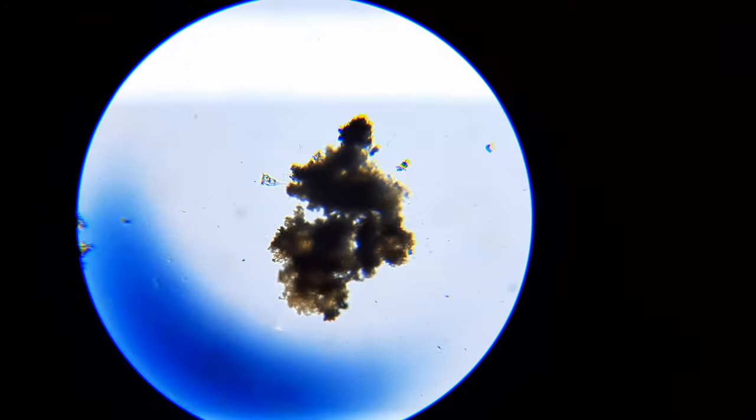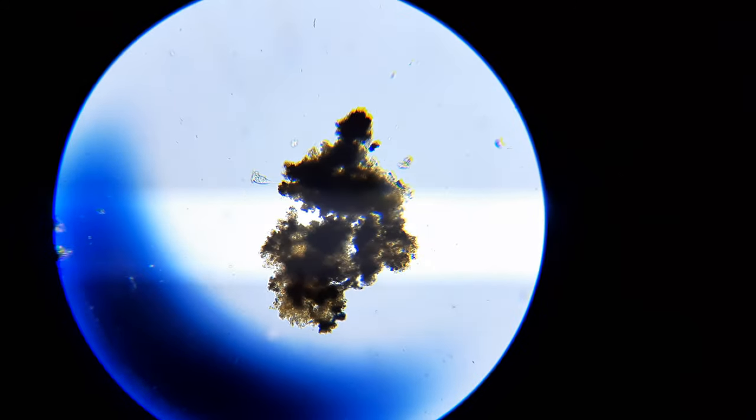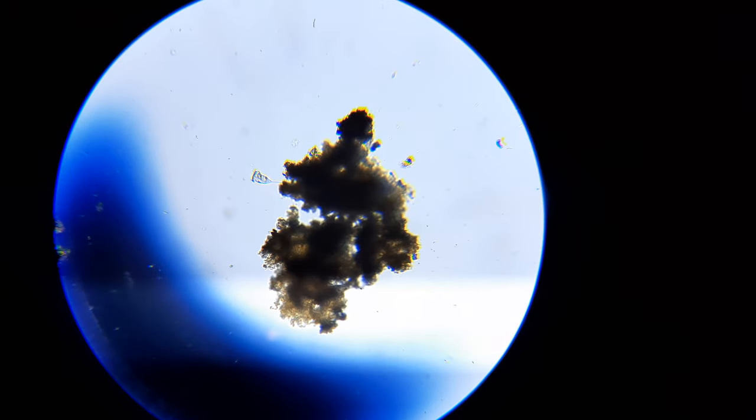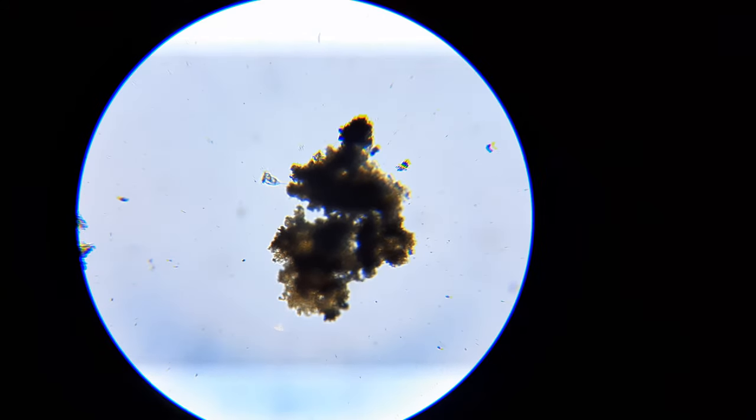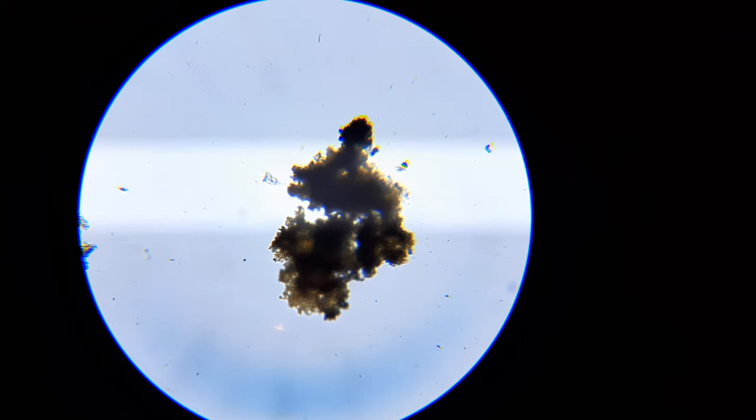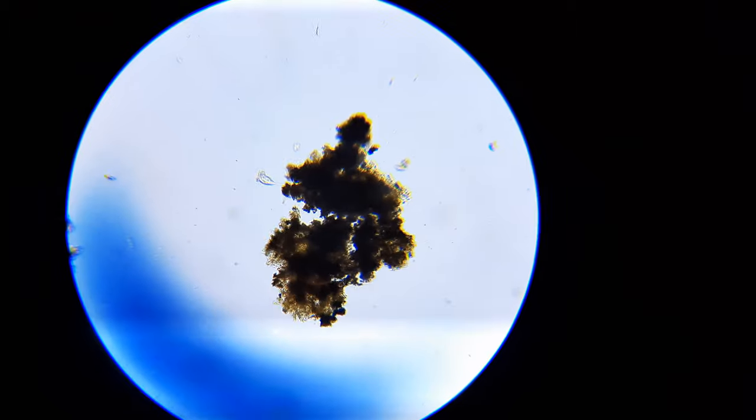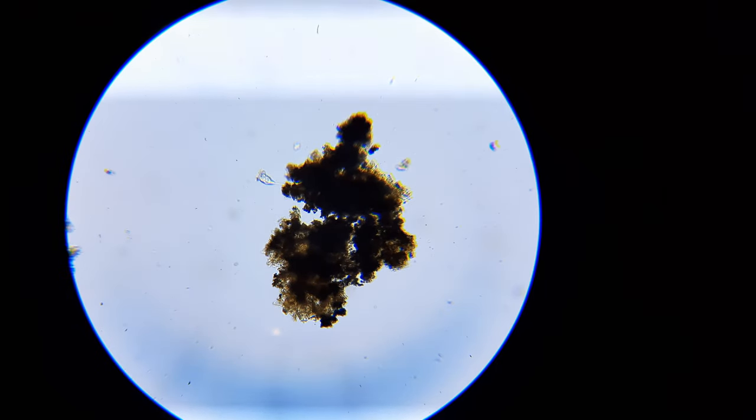I don't know why it wants to gyrate like that, but this clearly makes it possible to see the cilia.